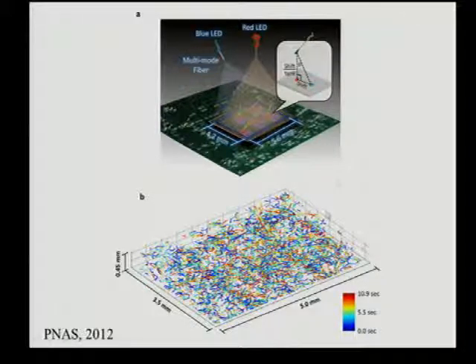What you notice here is that this is not the same design as before. It's slightly different in two ways. There are two illumination sources that are simultaneously on at two different angles and two different colors. This is by design to differentiate the vertical projection of the hologram from an oblique projection, so that we can pinpoint not only XY, but the Z motion.